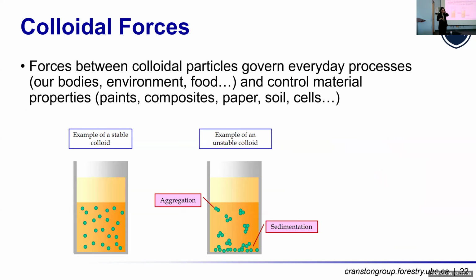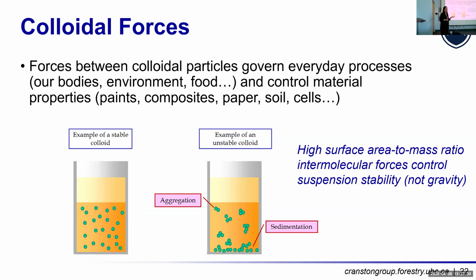And so now we're trying to measure these colloidal forces, which we know are the forces that govern everyday processes like biological systems and our environment, and are really important for material design, things like paints, composites, paper, soil, again, biological. But the short answer here is that when you have very small particles that have a high surface area to mass ratio, it's the intersurface forces that matter. Gravity does not play an important role.